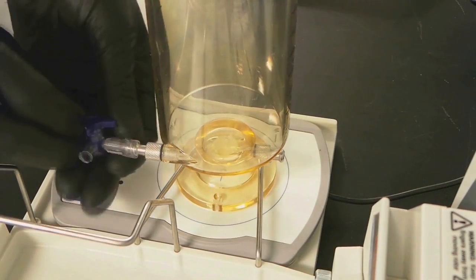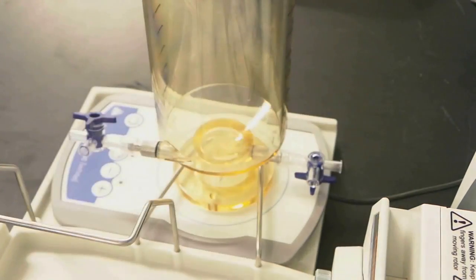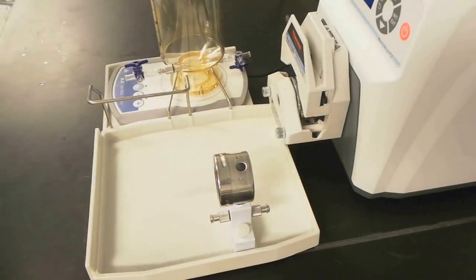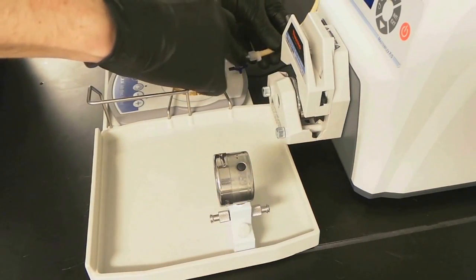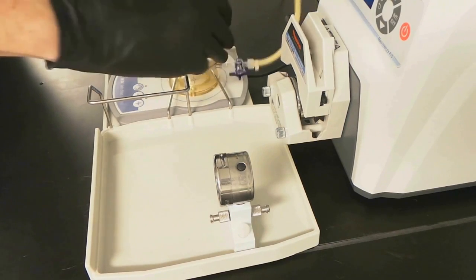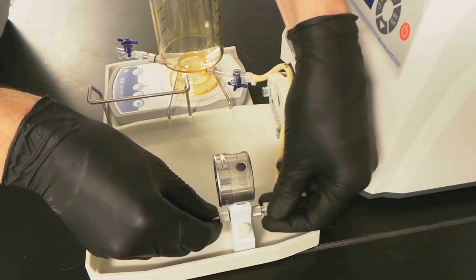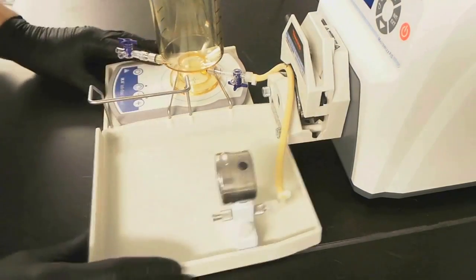Start by connecting a three-way valve to both the inlet and outlet of the reservoir. Take the long piece of tubing and attach it to the outlet valve on the reservoir, then attach the other end of the tubing to the pressure gauge, and guide the tubing into the pump head.